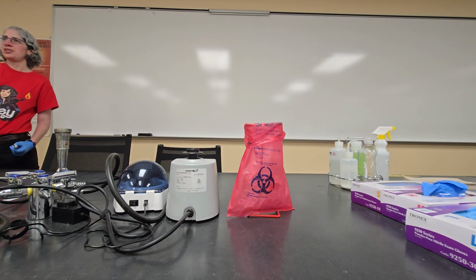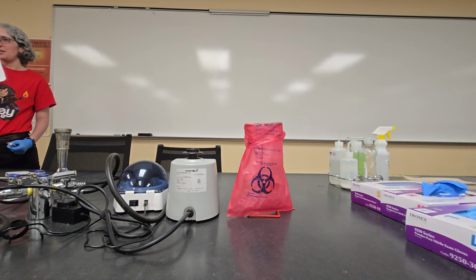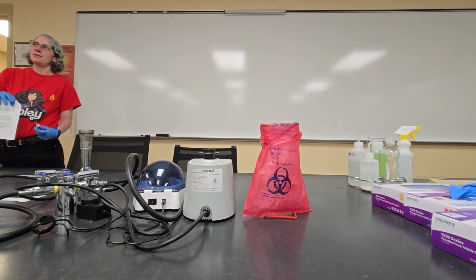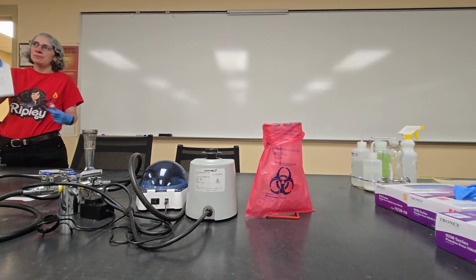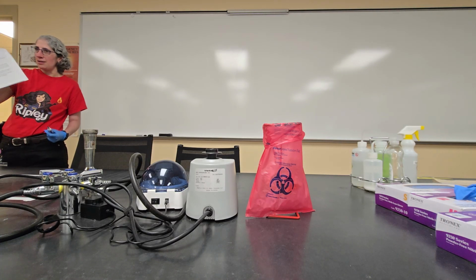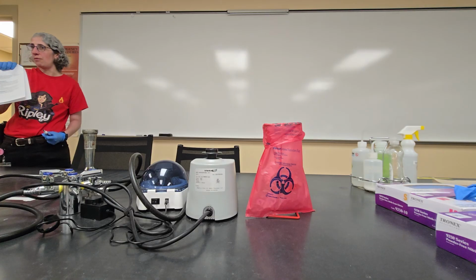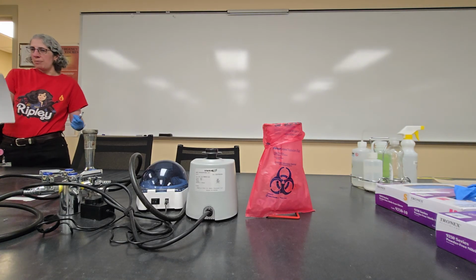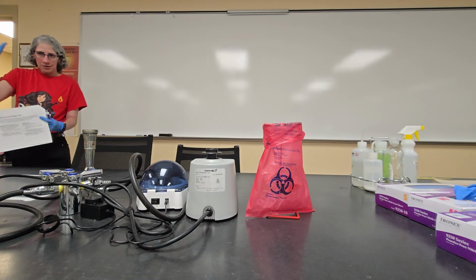So this is assuming that you have gotten at least one plate that has between 20 to 200 plaques. You can go up to 300 plaques on this. That you can use to calculate your viral titer, right? So how many plaque forming units per mil? So how many little viral particles per mil?